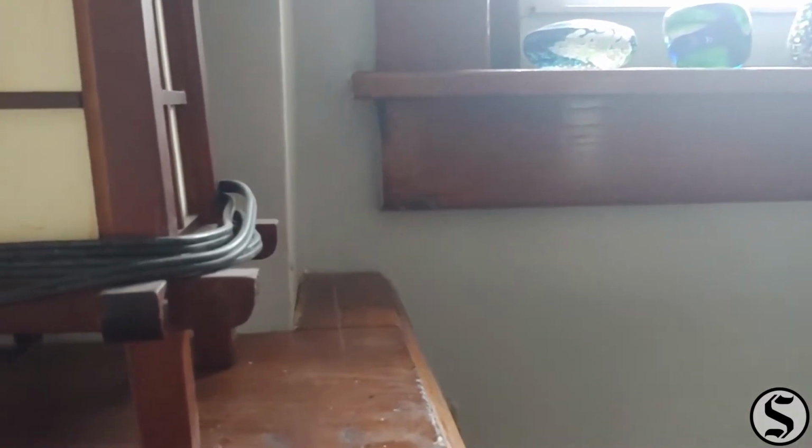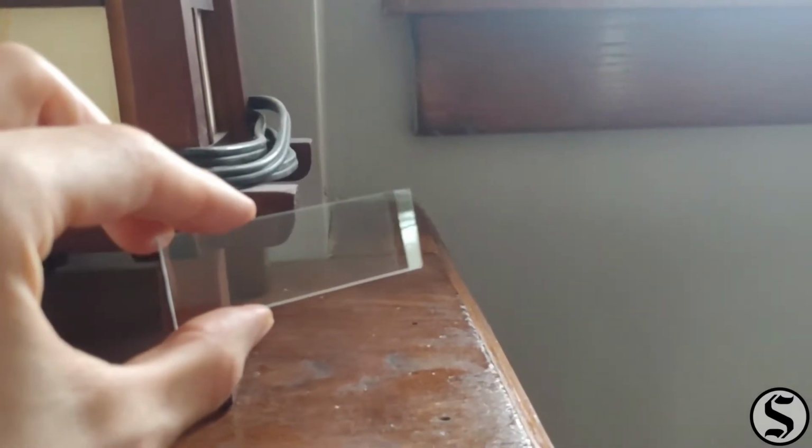Today's sample is a thread of spider silk. You might not be able to see it too well, but it's there, and collecting it was just a simple matter of swiping the slide across. Let's check it out.